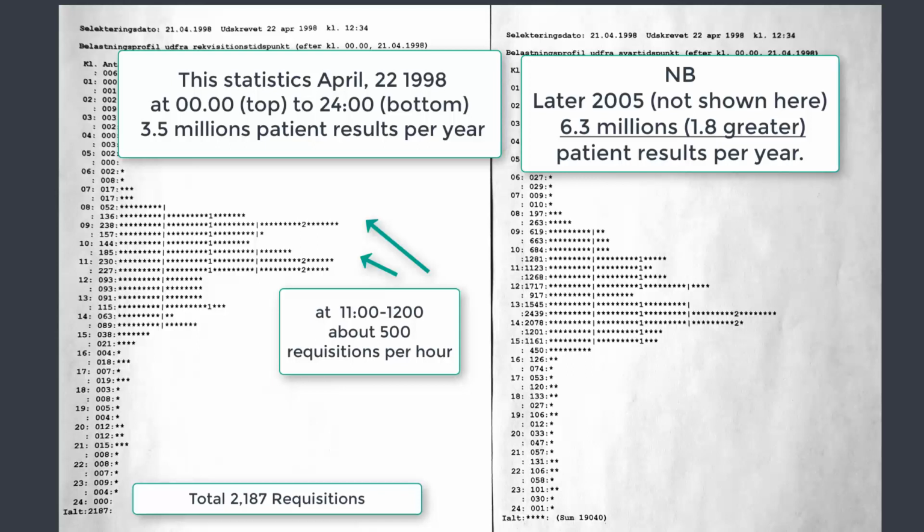At the same time as the requisitions appear, the main part of the samples come to the laboratory. The sample tubes go on to the instrument. It is therefore a must that the requisition data are updated without delay, as the analyzer instruments can look up in the system to see what they have to do, as well as dispatch of work orders for the instruments must be done without delay.